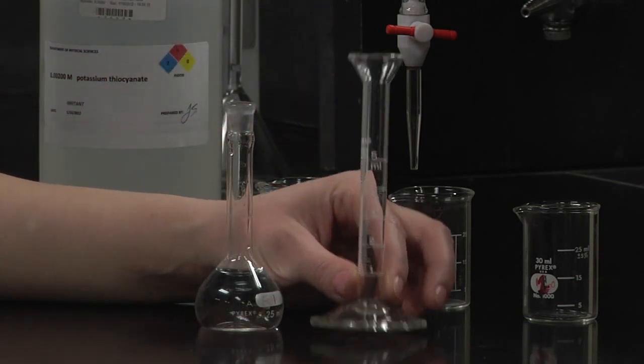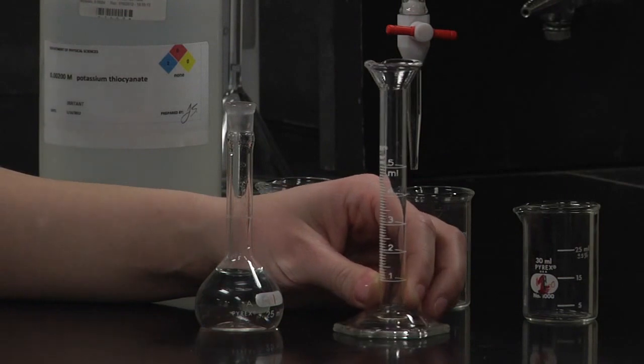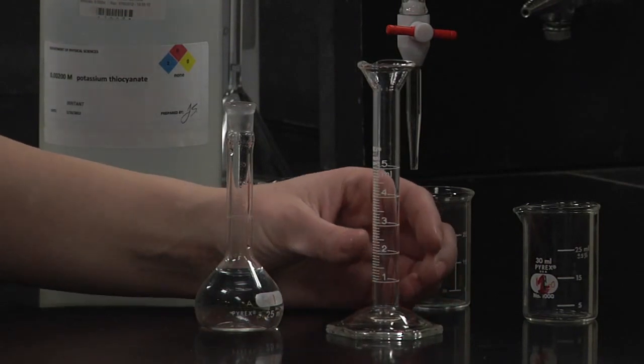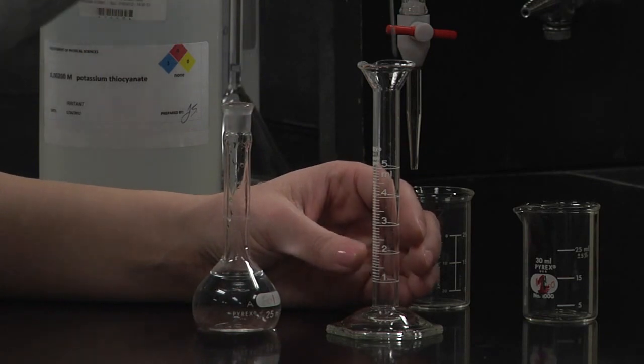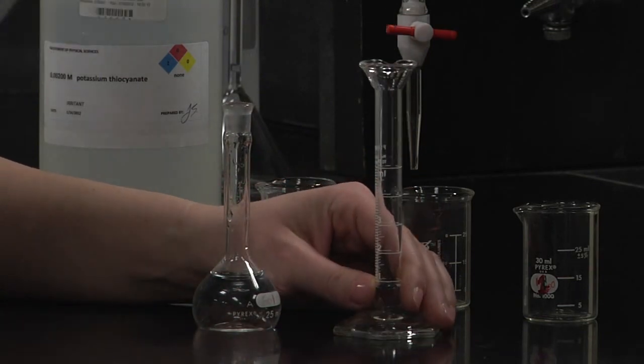Preferably one that only goes up to 5 milliliters because it will be more accurate. I'm going to take some out of here and fill this up until I get to 3 milliliters. Now that we've added our dilute iron solution to each of our beakers, we will now add the designated amount of nitric acid.